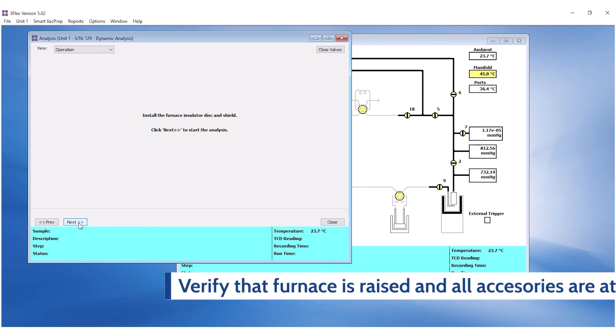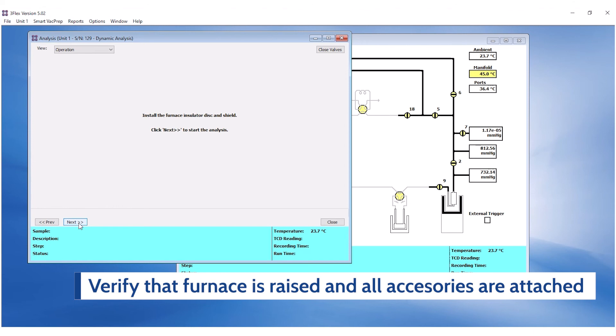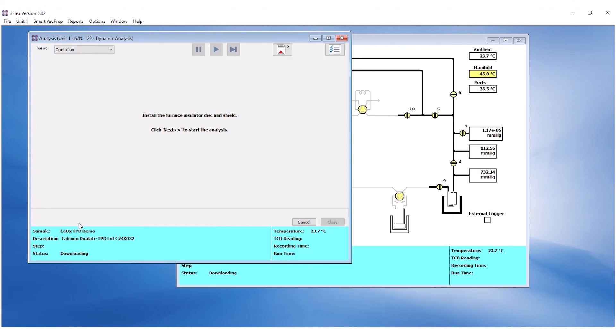Verify that the furnace is raised, sample thermocouple, insulator, and shield are installed. Click Next to start the analysis.